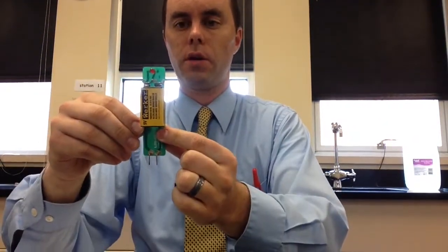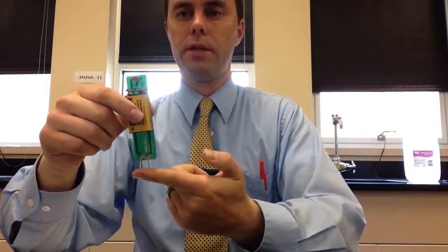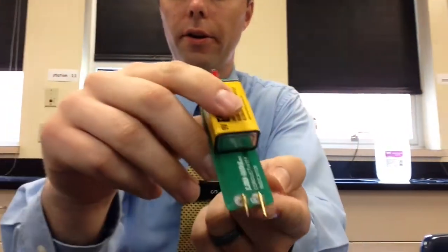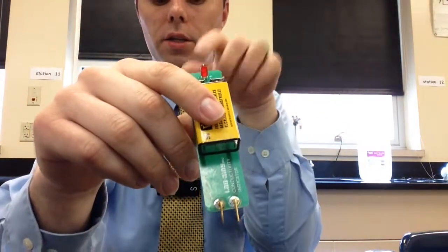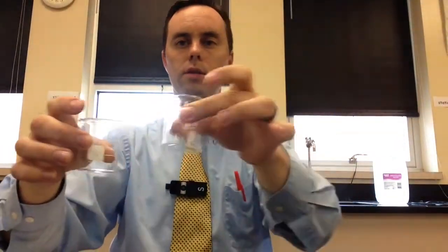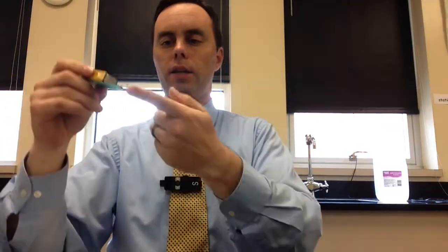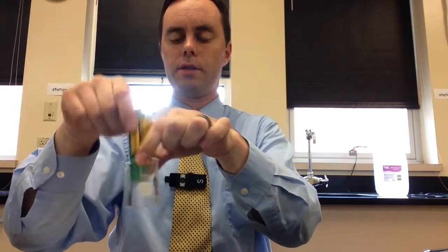All right, next step you're going to do is you're going to use this instrument. This is called a conductivity probe. It measures if the substance, these 2 probes that you can see down here at the bottom, they measure if the substance that they're touching conducts electricity. So what you're going to do with the dry substances, you've got salt in one of these and sugar in the other, you'll take these probes and place them into the beaker into the dry substances down there.